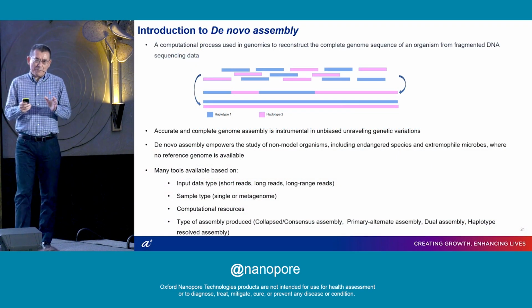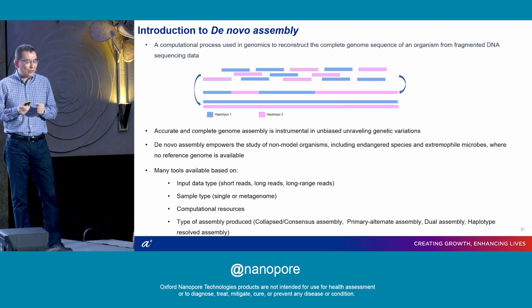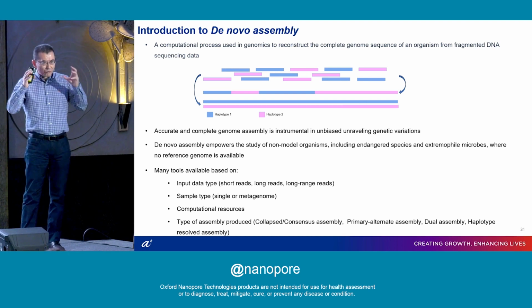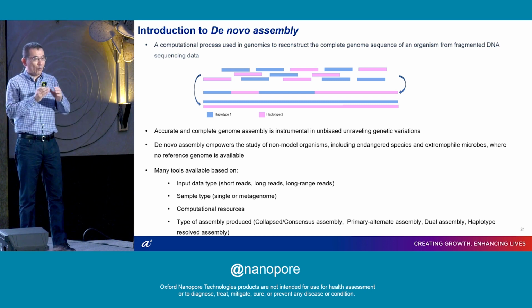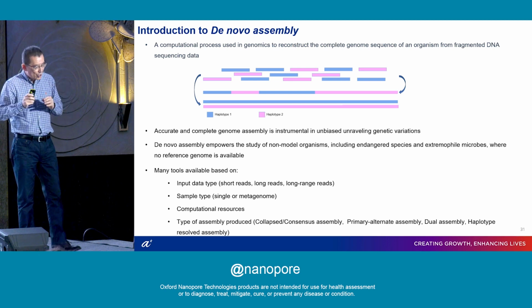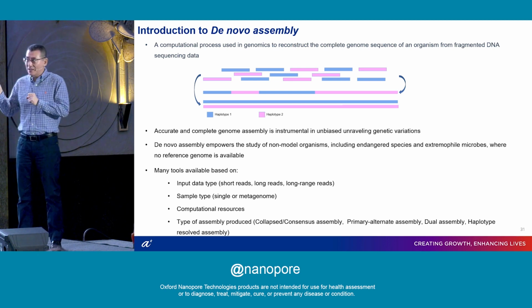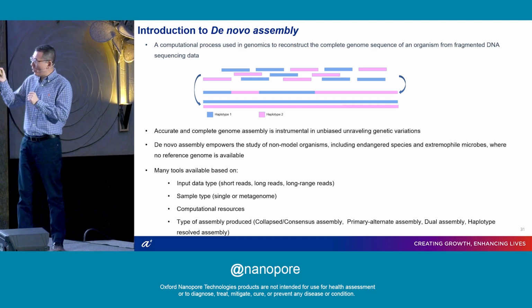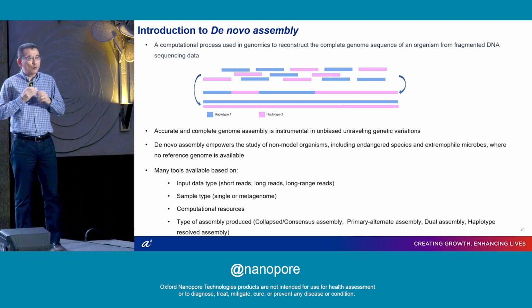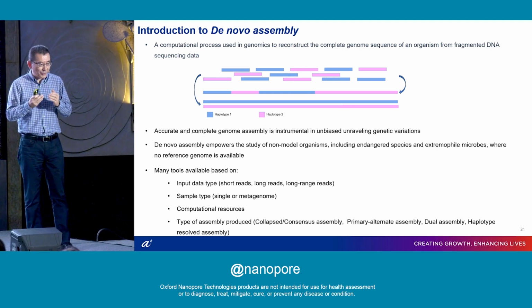Allow me to give a very brief introduction. What do we mean by assembling? Assembling is a computational procedure to reconstruct the genome sequence using fragmented DNA sequence data, called reads. Use the human genome as an example: we first generate the reads, overlapping and covering the whole human genome. The colors of the reads represent their chromosomal or parental origin.